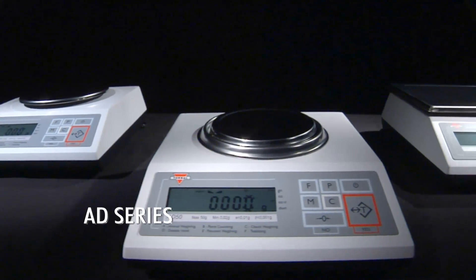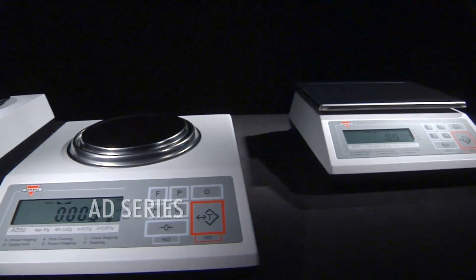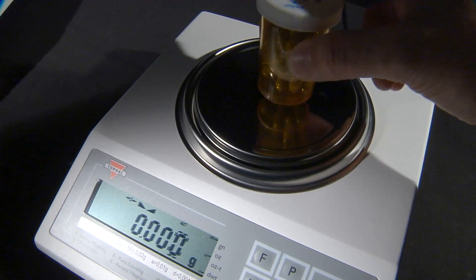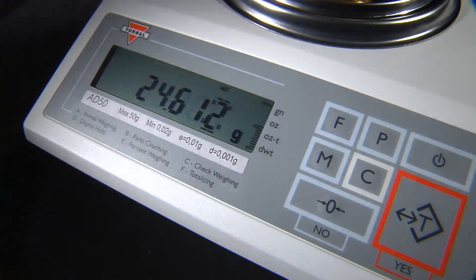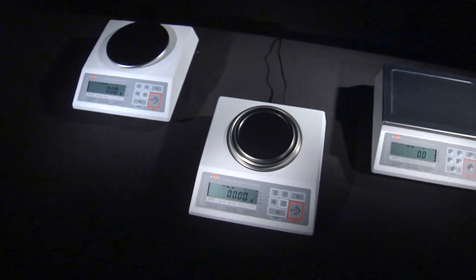The AD series scales are easy to use and most importantly, very accurate. The series is ideal for any lab application that requires durability and low maintenance.